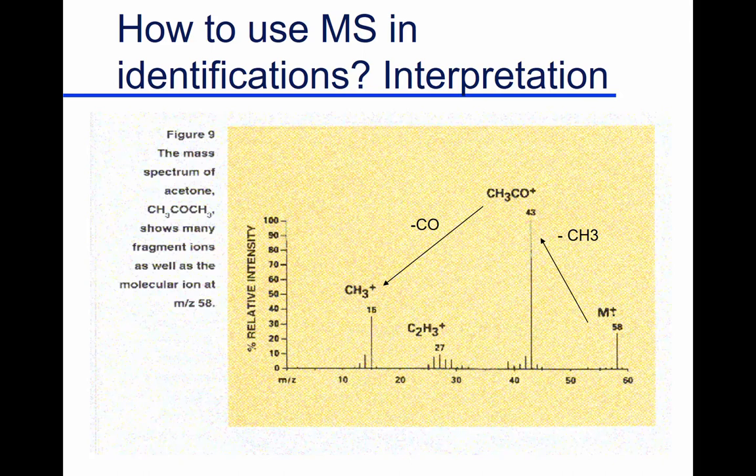You can look at those fragments, and through experience, you can say, I've got a good idea of what this is. It takes a good deal of experience, and a good deal of chemistry. Another example is, you'll always find a loss of 31 when it's an alcohol. There's no alcohol here, so I'm not pointing to a loss of 31. But if this were an alcohol as an unknown, look for a loss of 31. If it's an aromatic ring, a benzene ring, you'll see a 77-78 for the benzene ring. So if you run it enough and have an understanding of chemistry, you can do a lot on small molecules to identify them too. So you do this with care.